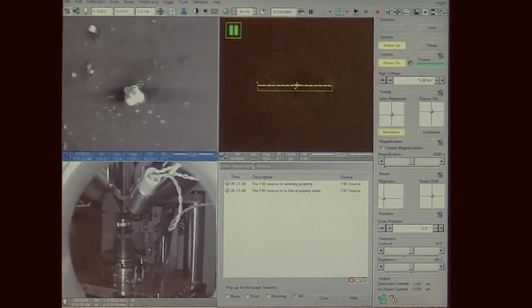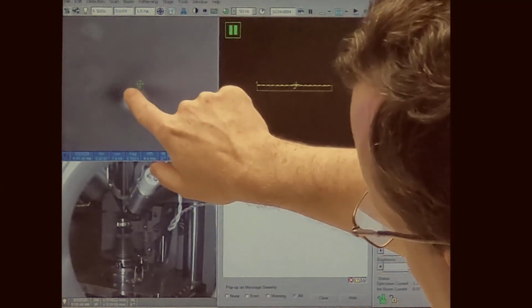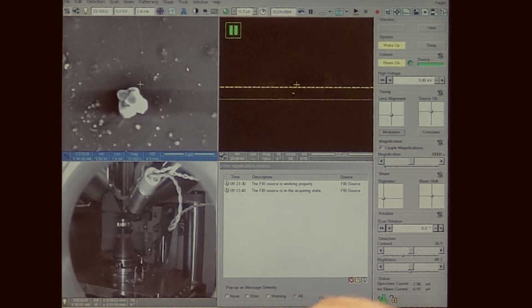movement. So if you're way off, you can see you get a lot of movement. So got a little bit of left, right, left. Move too far. There we go. That's pretty much just going in and out of focus. So that shows that our alignment is good. So now we can zoom in even further. So we zoom in, we zoom in.